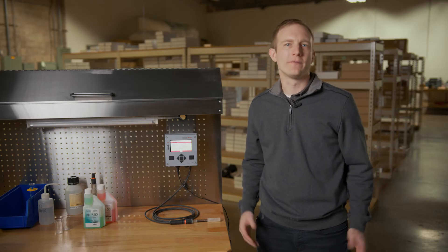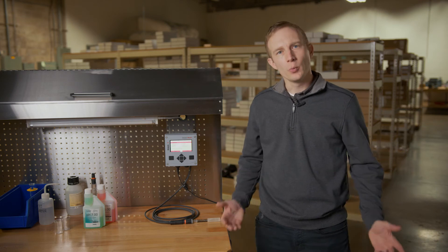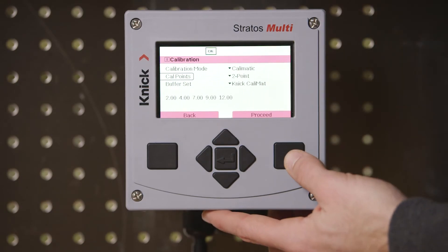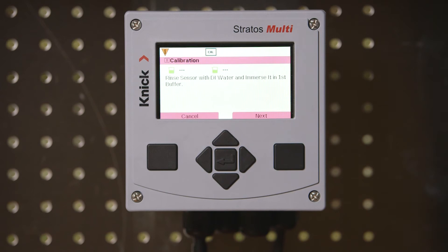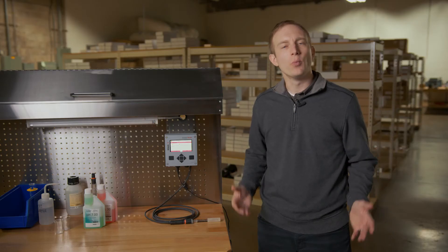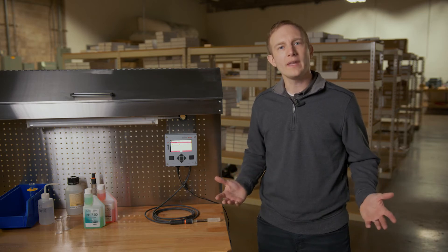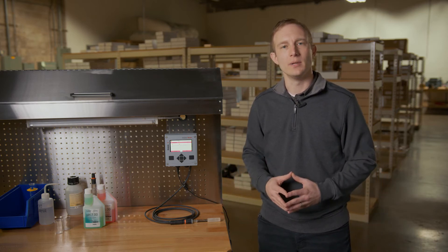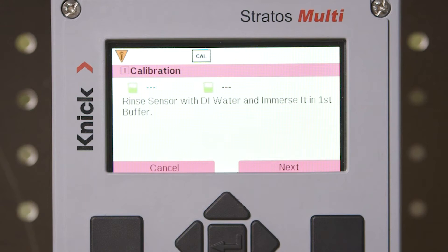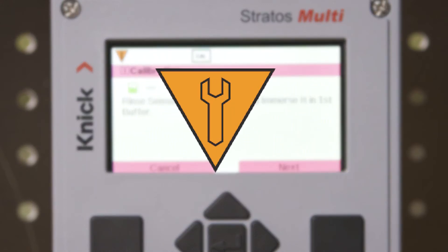Once we are ready to perform our calibration process we will press enter on the proceed button to move on to the first steps. As you can see once the calibration process begins the transmitter enters a hold mode holding the output back to our control system. This is also indicated by the wrench icon in the upper left corner of our display screen.